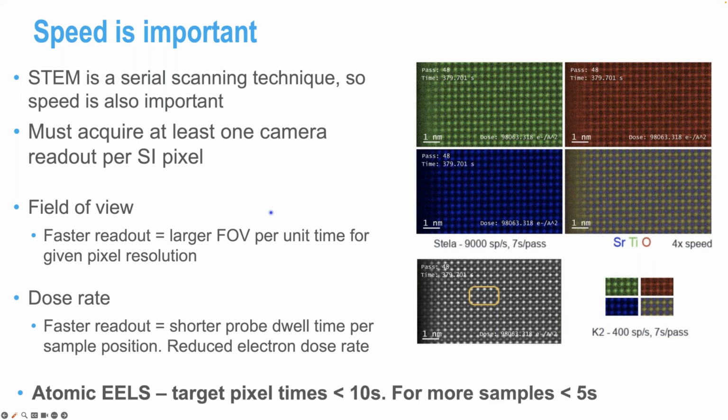If the samples are more challenging, so high drift rate, or if you just put it in the microscope and want to image immediately, then probably something less than 5 seconds is going to work better. The faster you go, the fewer non-rigid artifacts you're going to have in each scan, and the less the drift is.